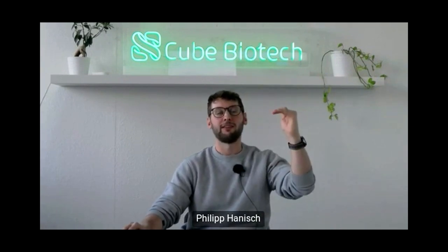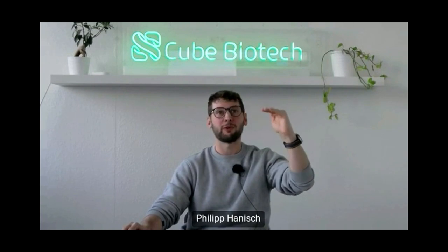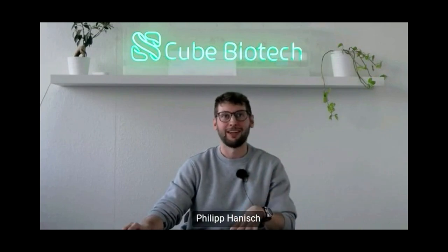And we found out that you can correlate the response units with the actual amount of protein you have in there. Of course, this only works if your protein carries tryptophans, and it works less well when it has very little, and better when it has a lot of tryptophans. But with this and your extinction coefficient, you can pretty closely get to the protein concentration.